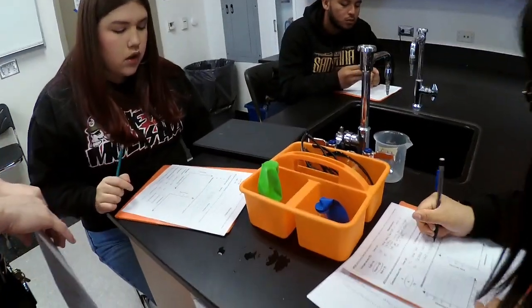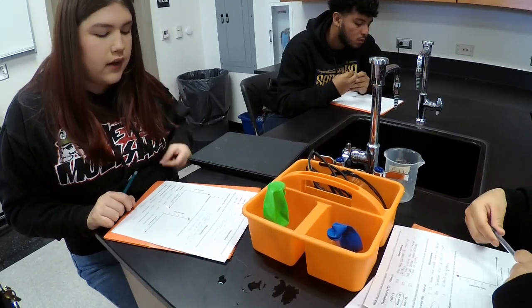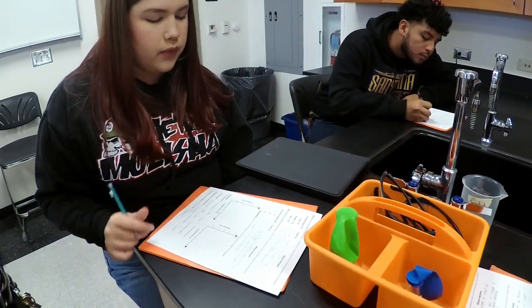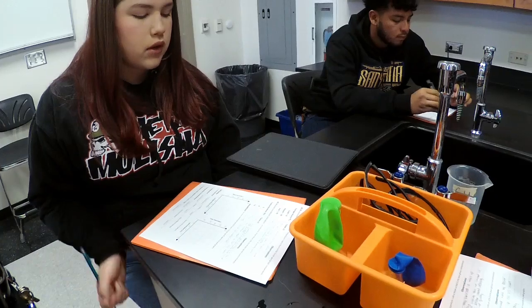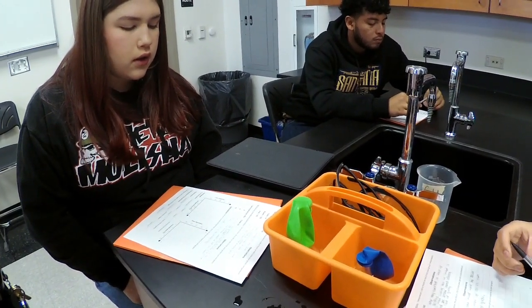So what do we see? Do we notice any trends that are already in the concentration? Yeah, like the stronger it is, the quicker the balloon filled up. So the more concentration, the quicker the balloon filled up. And then what about the temperature? Does anything feel kind of off right here?